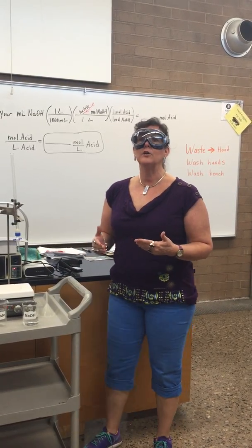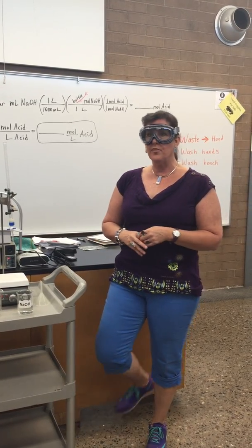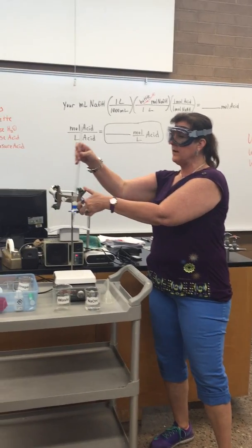I'm going to tell you how to prepare your burette with sodium hydroxide for today's Chem 130 lab, which is the titration of vinegar and sodium hydroxide. So you're going to go get a burette.